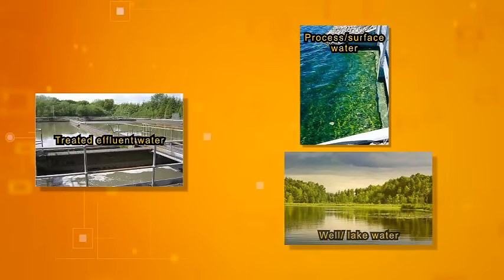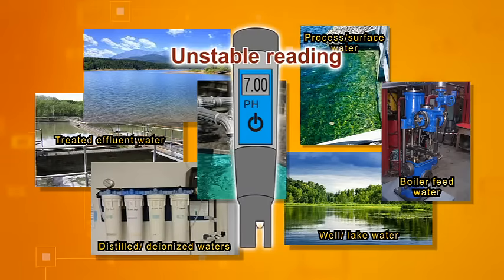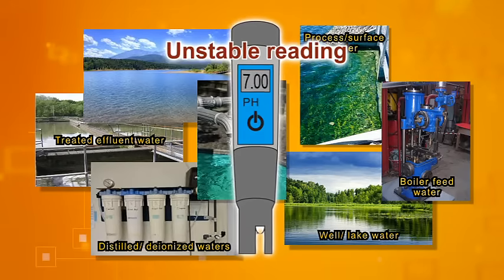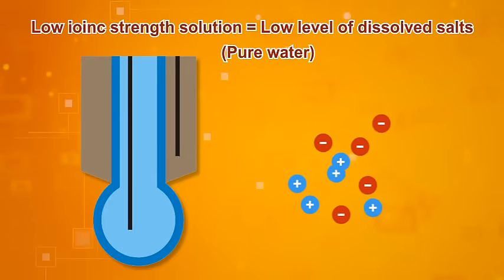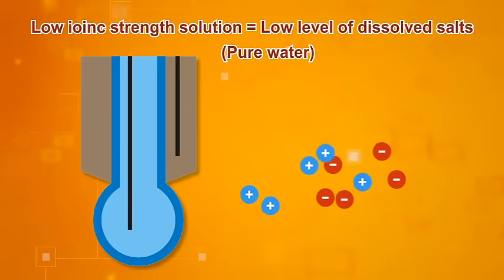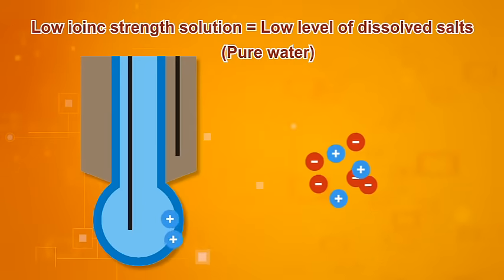Do you know why you often see unstable pH readings while testing deionized water, lake water, boiler feed water, process water, or treated effluent water? The answer is some water bodies have low ionic strength — they contain little dissolved material — and this affects the response of a pH pen.